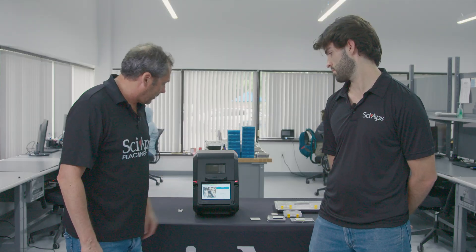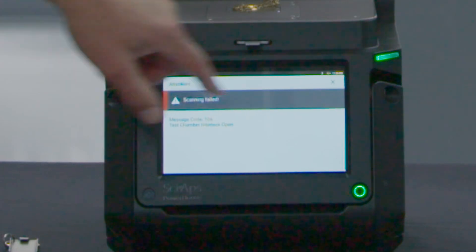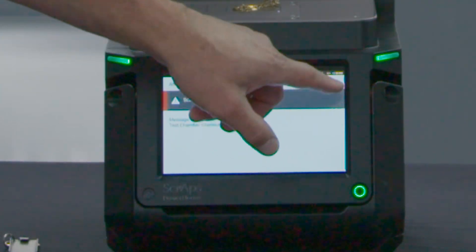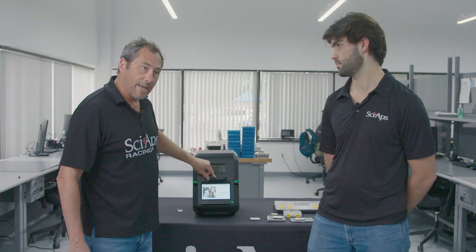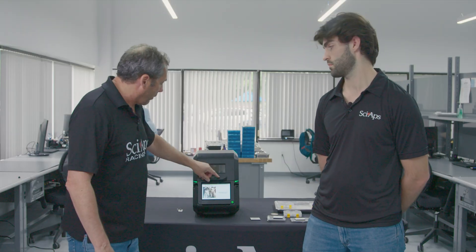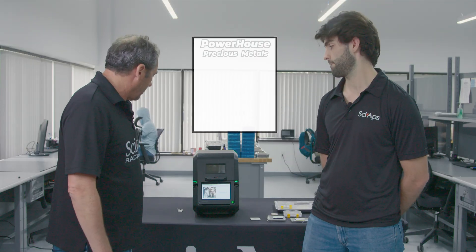Just to show you safety-wise — let's say you're running a test, somebody comes along, they open the lid, and see: it immediately shuts off the x-ray. It's a completely safe system. It's interlocked whether or not you mechanically lock the cover — it's still interlocked for safety. The reason for the mechanical lock is if you want to pick it up and carry it, you don't want the lid opening up accidentally.